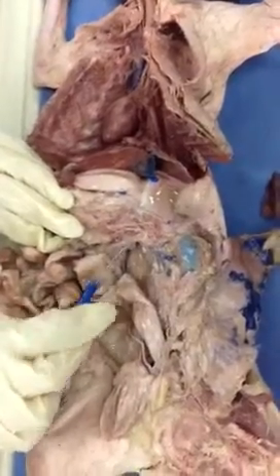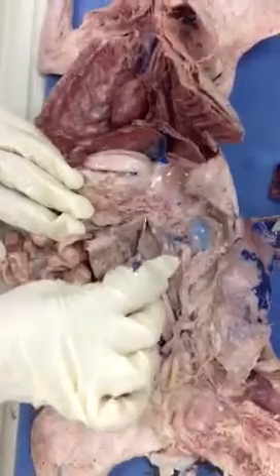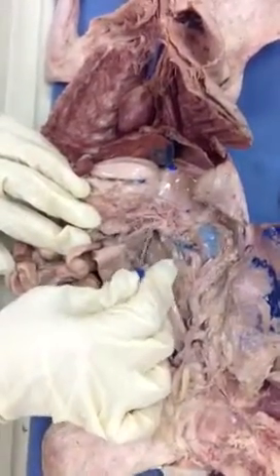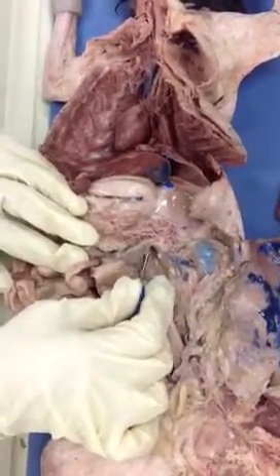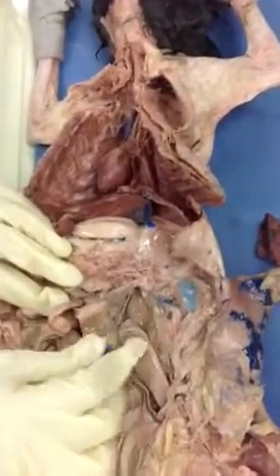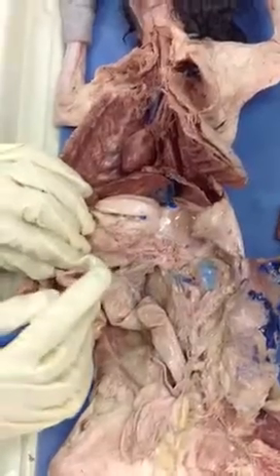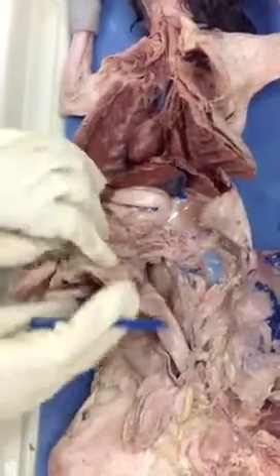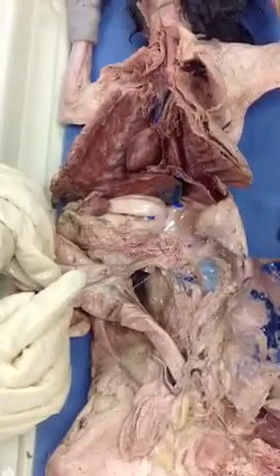Then I have another branch. So here is another branch, or the second branch of the abdominal. What's the name of this one, please? Superior mesenteric. Superior mesenteric artery. What does it provide blood supply to, please? Pancreas, small intestine, and colon. Very good. So the way we verify our theory is by following it, right? And we notice immediately that it's going towards the large intestine. Do we see how it's going to the large intestine?